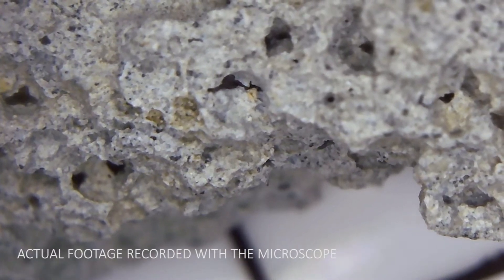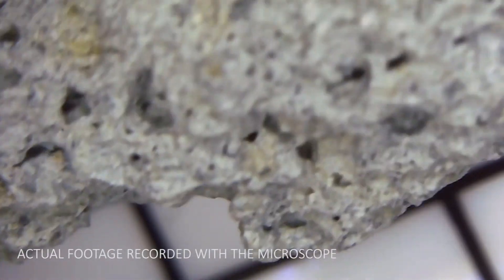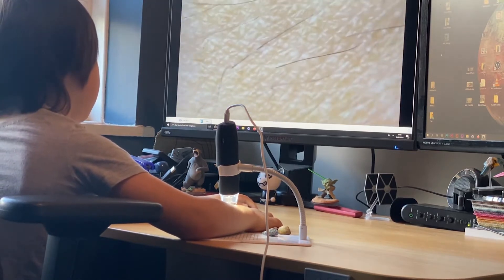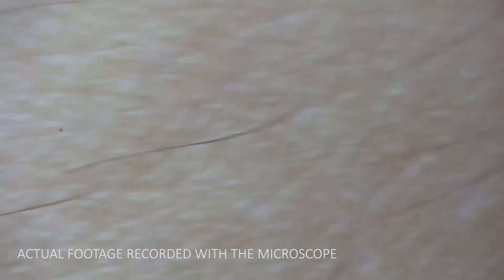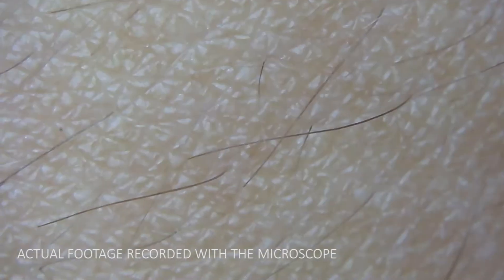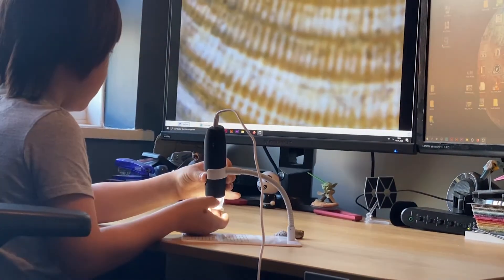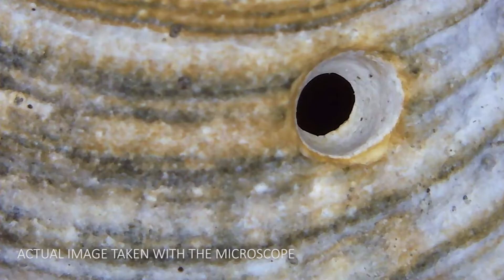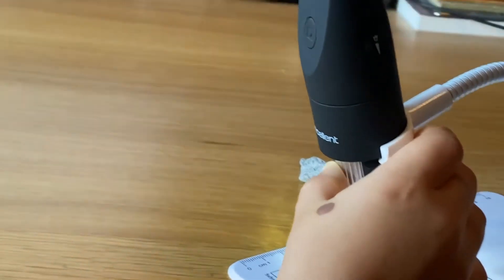This is the concrete footage recorded with this microscope at full resolution — no compression, so that's the footage you get. It's great to explore your own skin too: you can see all the little uneven aspects and see that it's not smooth at all. The results are okay — not great, but good enough for kids to have fun with. You can record all the footage and take screenshots of anything. Like this screenshot I took, which looks quite cool — it looks like a planet or something.